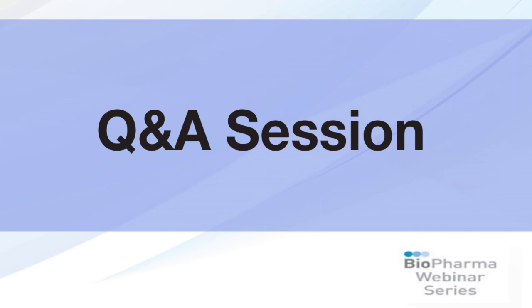Yeah, I'm a bit in doubt on what exactly an HT screening is, but overall, as I already mentioned once, the combination of methods is really strong, and I think that also includes what Colin just said, that combining MFI with some of the different techniques that you have available, for instance, Raman spectroscopy, really enables you to get a good impression of what you're working with. So I would say go for a couple of methods and don't rely on a single one.